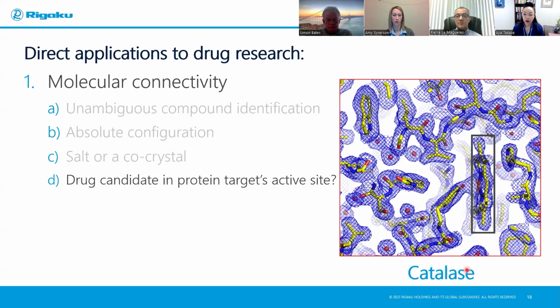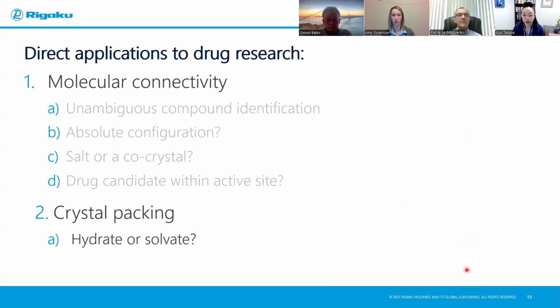As a result, single crystal structure determination is critical to screening drug candidates with target proteins and therefore widely used in structural biology. Let's move on to crystal packing now.